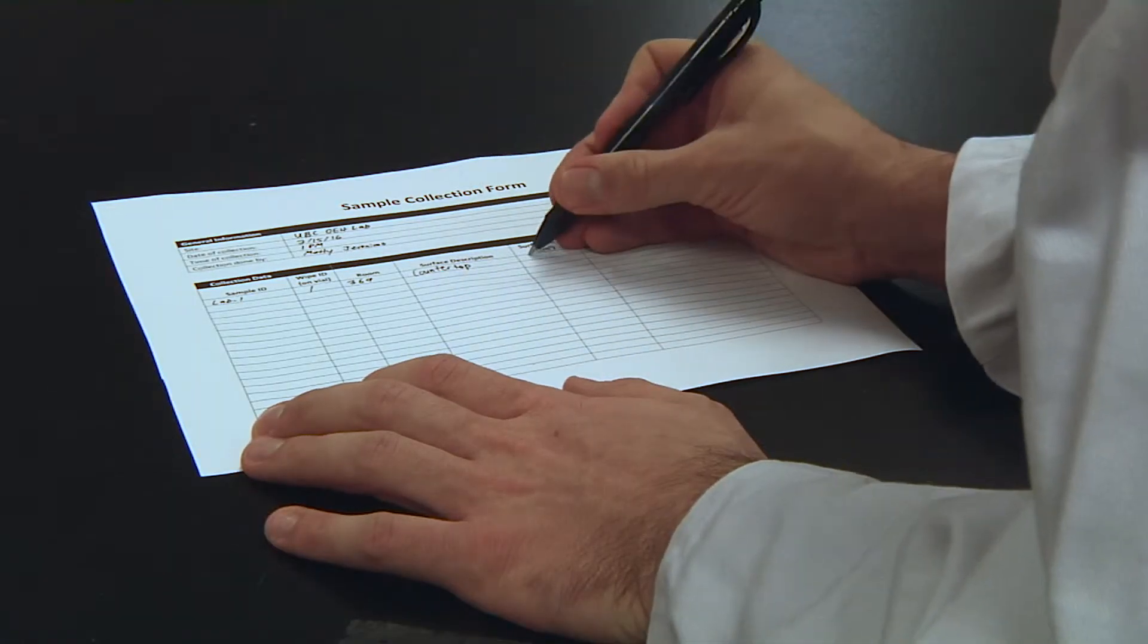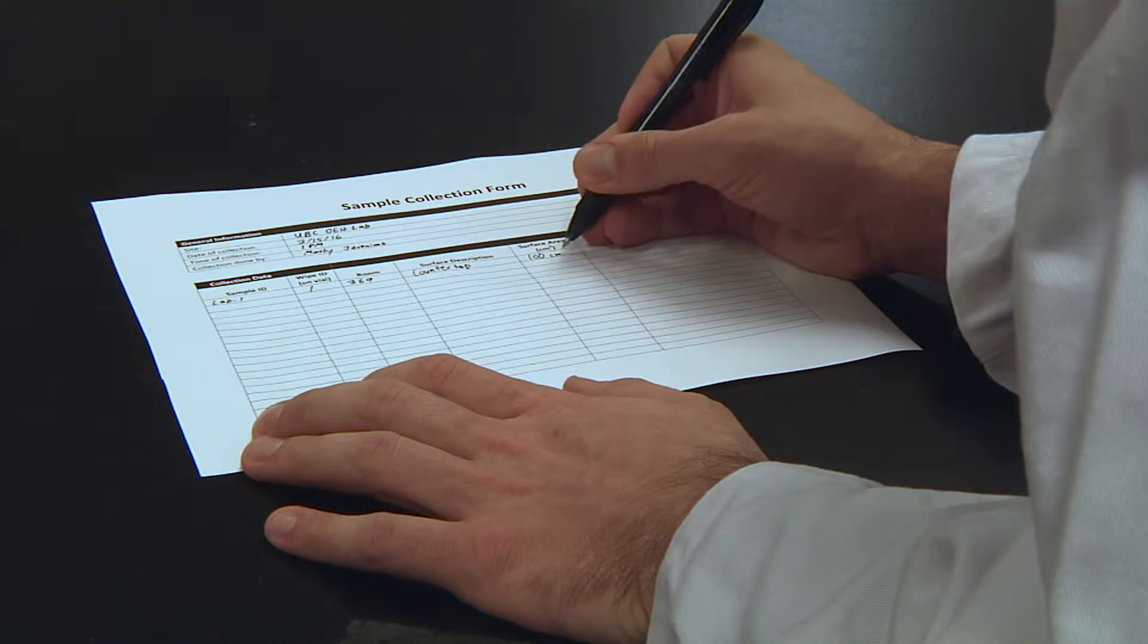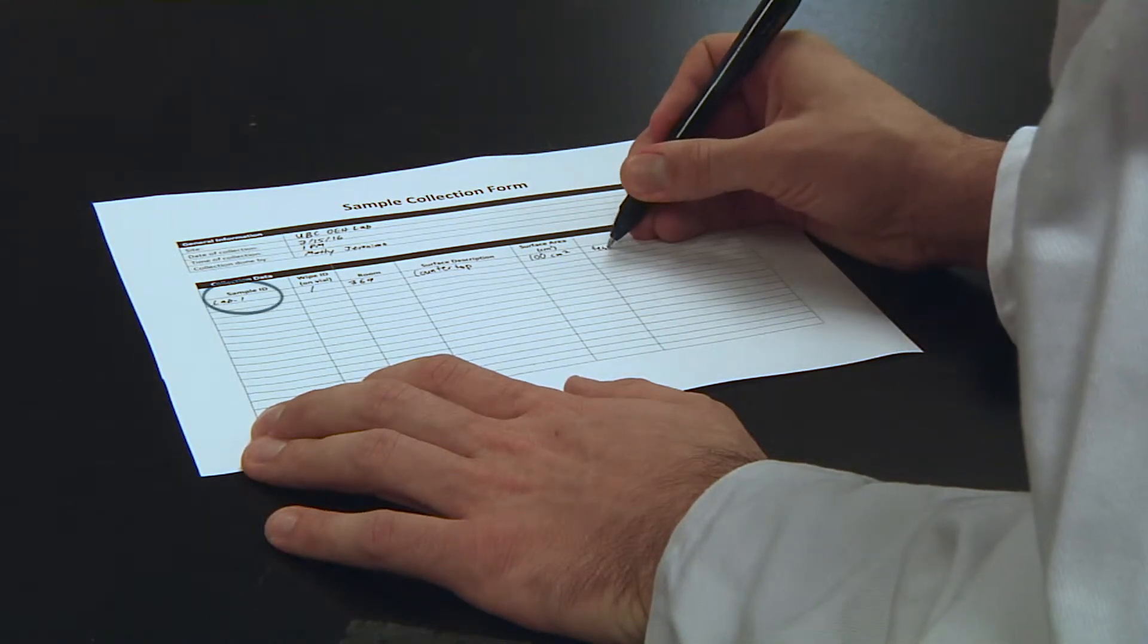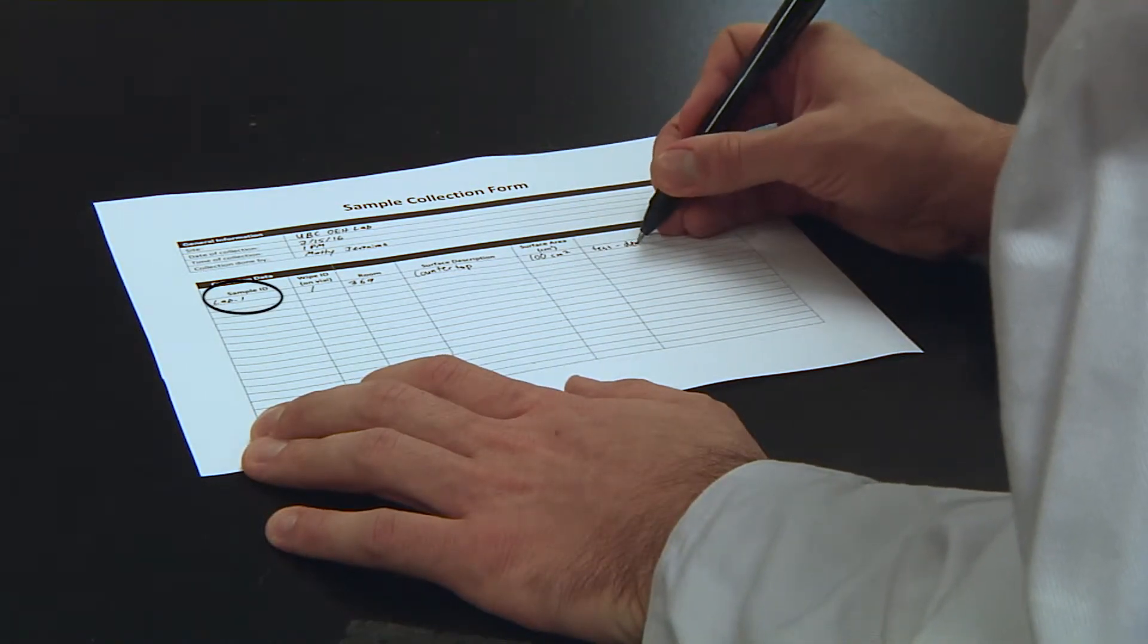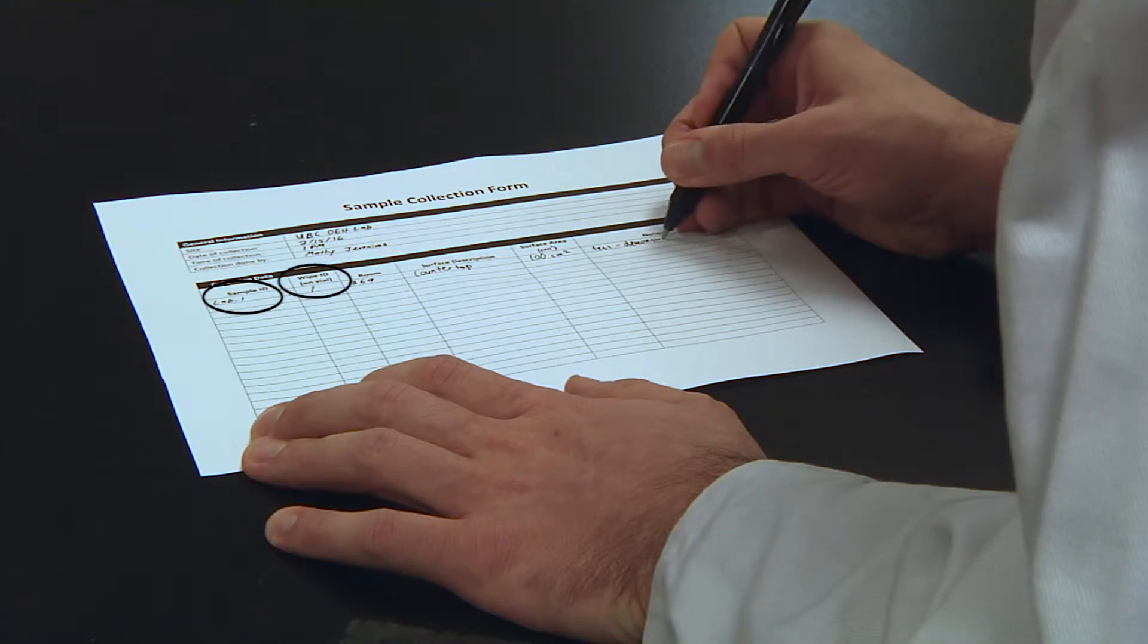Make sure your sample information is noted on the collection form. Label the sample for your own reference in the sample ID column and note the wipe ID written on the vial in the wipe ID column.